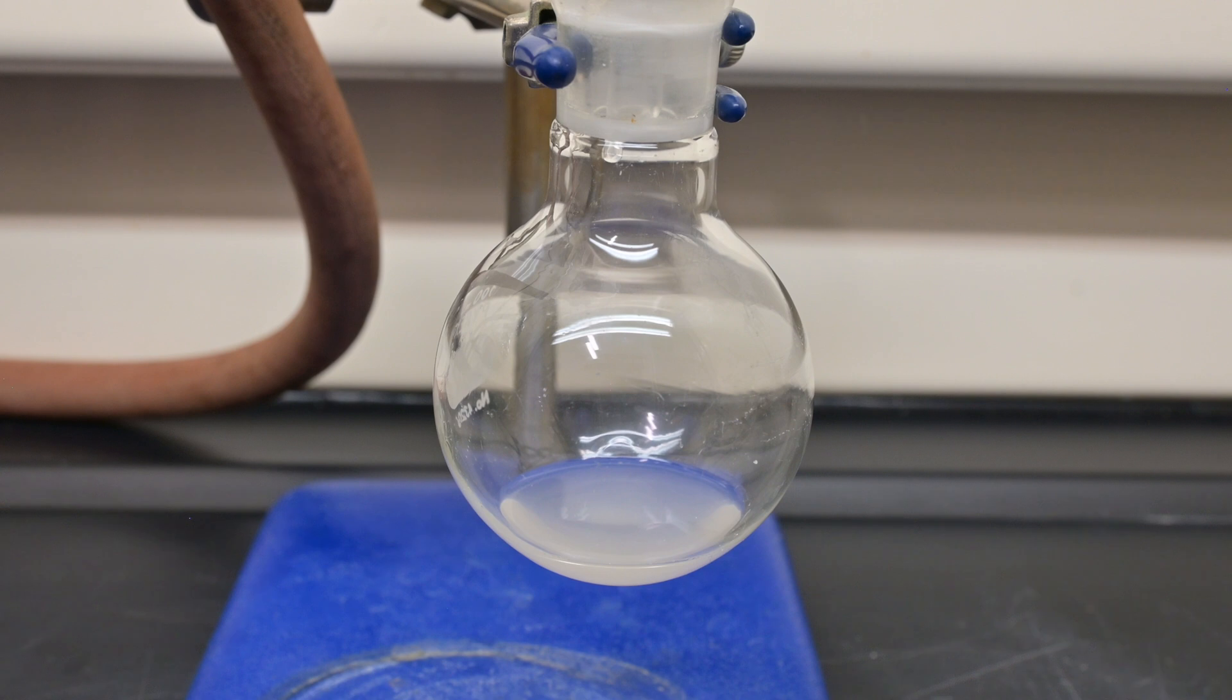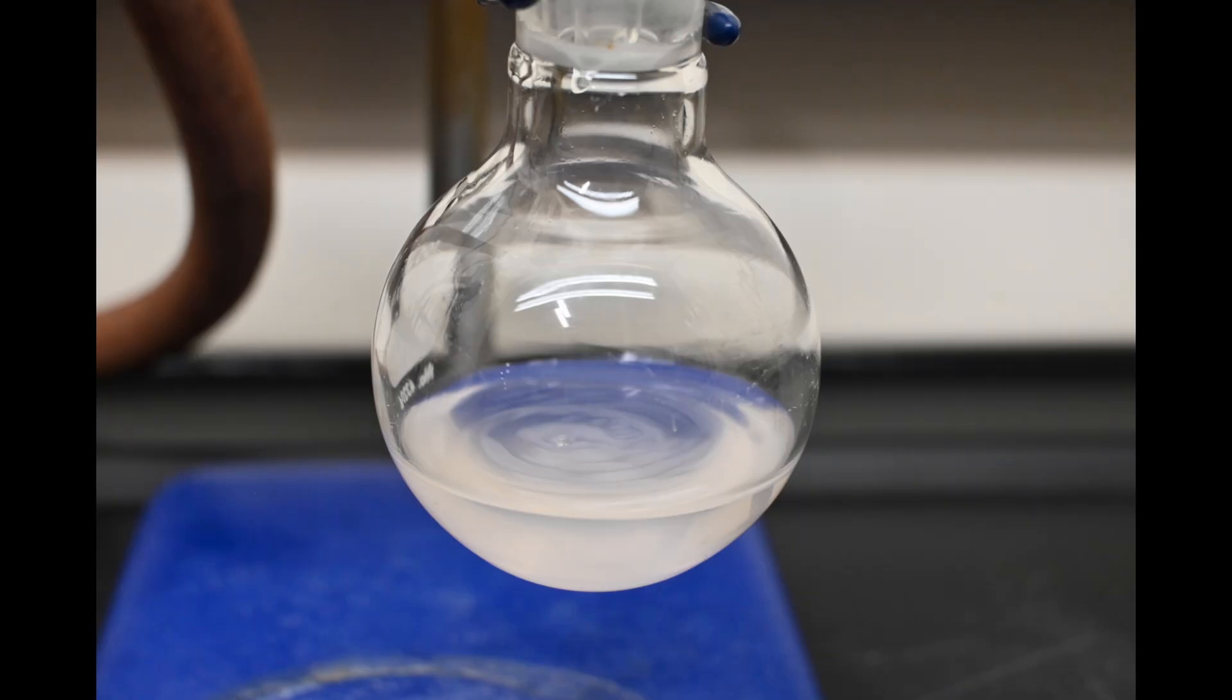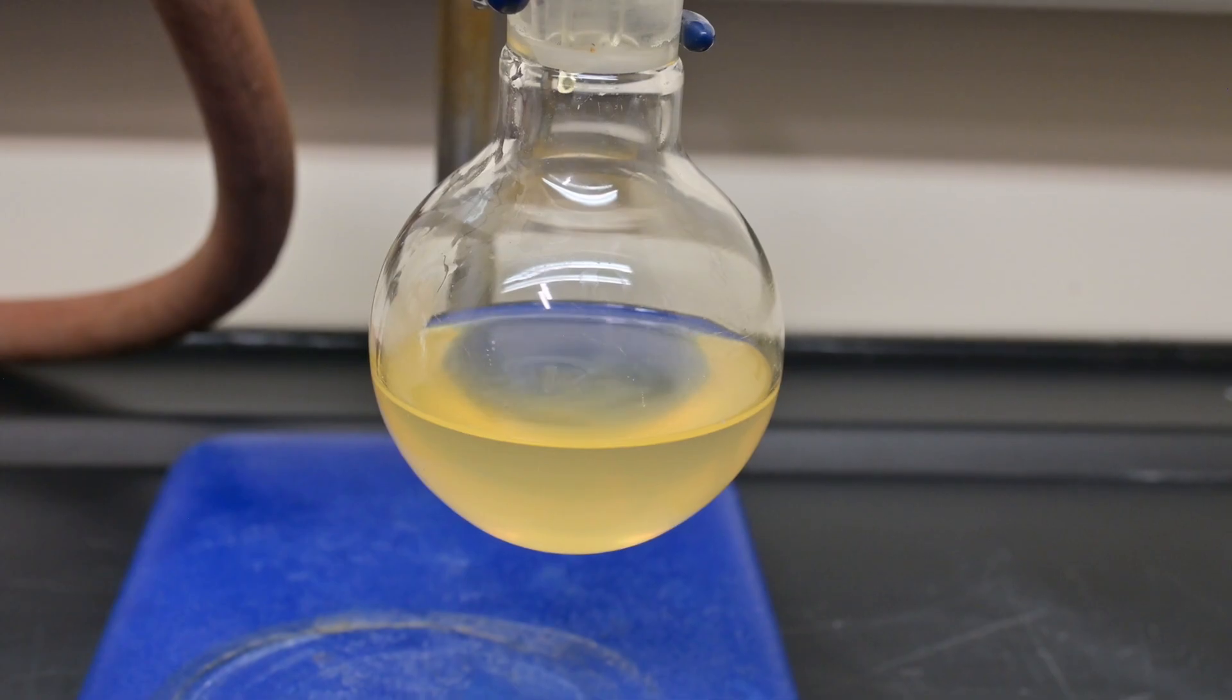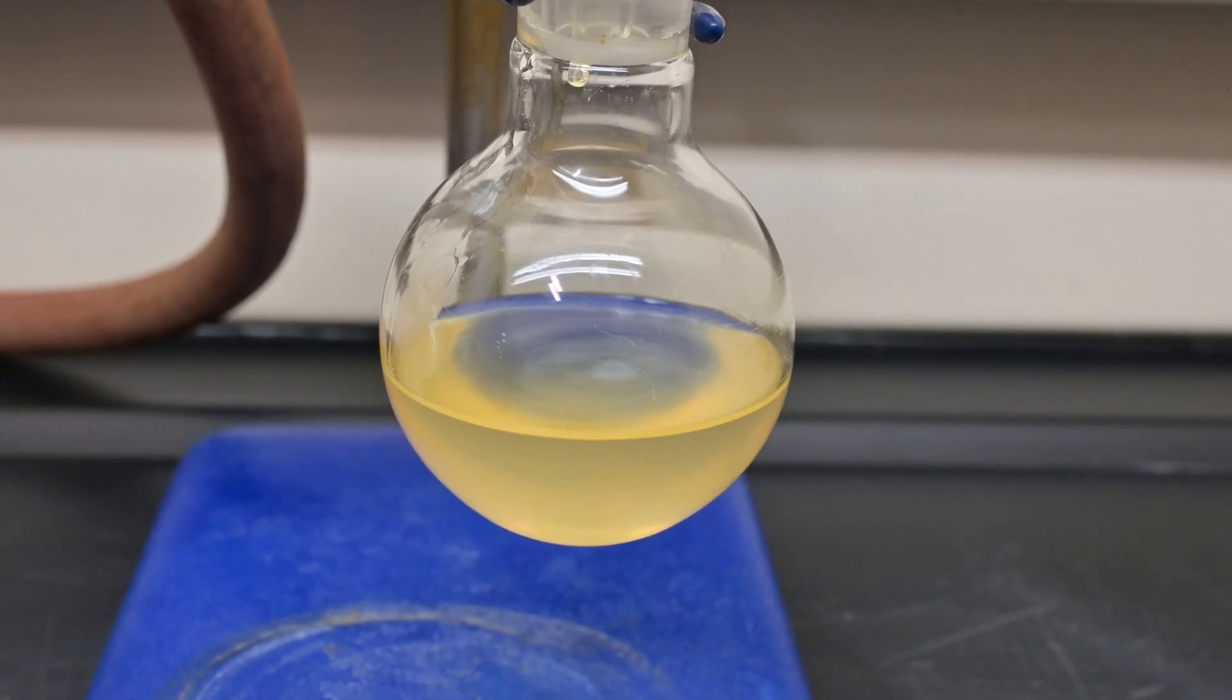After a little bit, it works its way down the condenser and rolls into the collection flask. It started off nice and clear, but over the course of the reaction, it turned yellow. Shortly after the change in color, no more product came over.